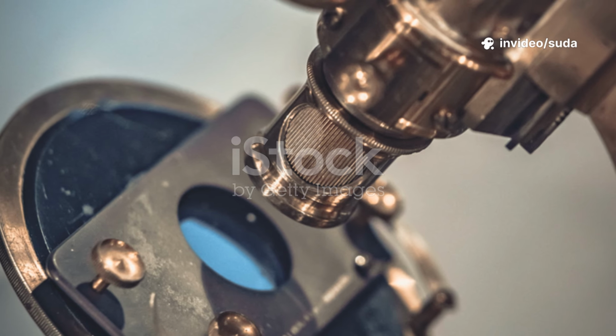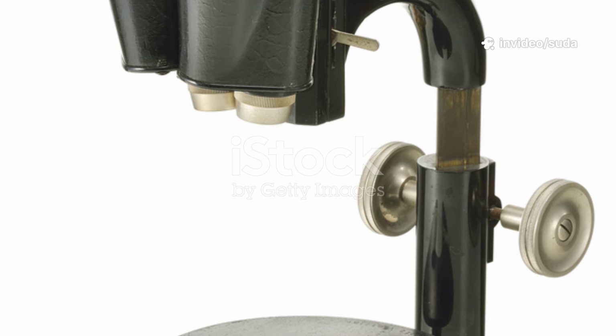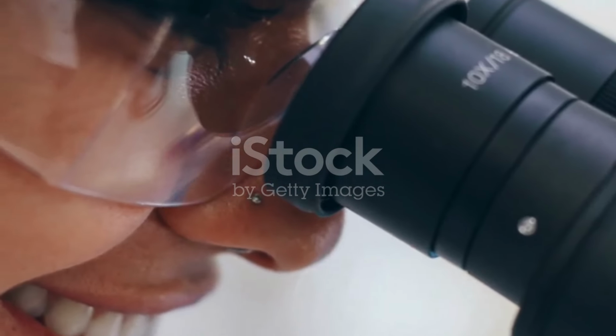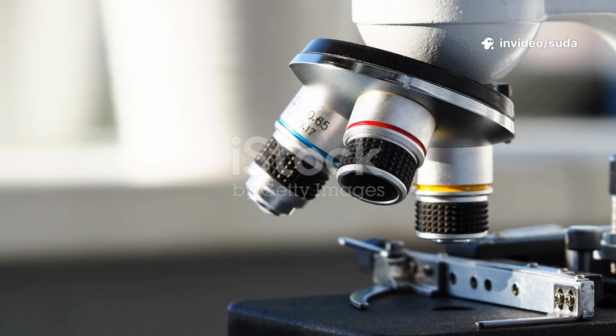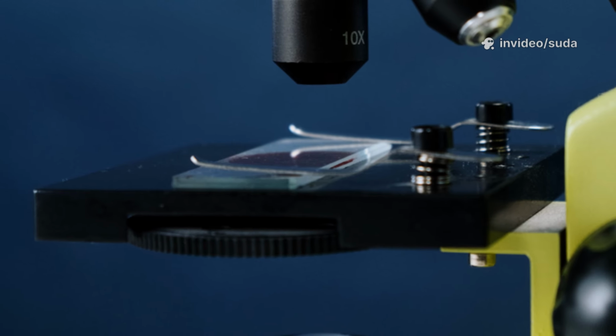To use a tool properly, you first need to know its parts. Think of it like a little tower designed for seeing. At the top is the eyepiece, or ocular lens, usually 10 times magnification. The body tube connects the eyepiece to the lenses below. This is the revolving nosepiece. It holds objective lenses, 4x, 10x, and 40x.